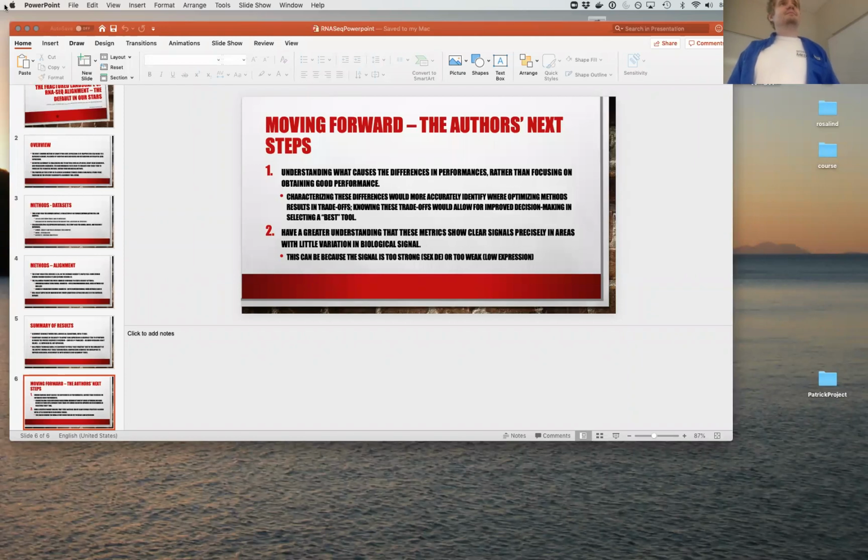Is RNA-seq alignment, under the covers, using heuristics, or is it just a straight statistical algorithm? These programs, I believe, use statistical analyses.